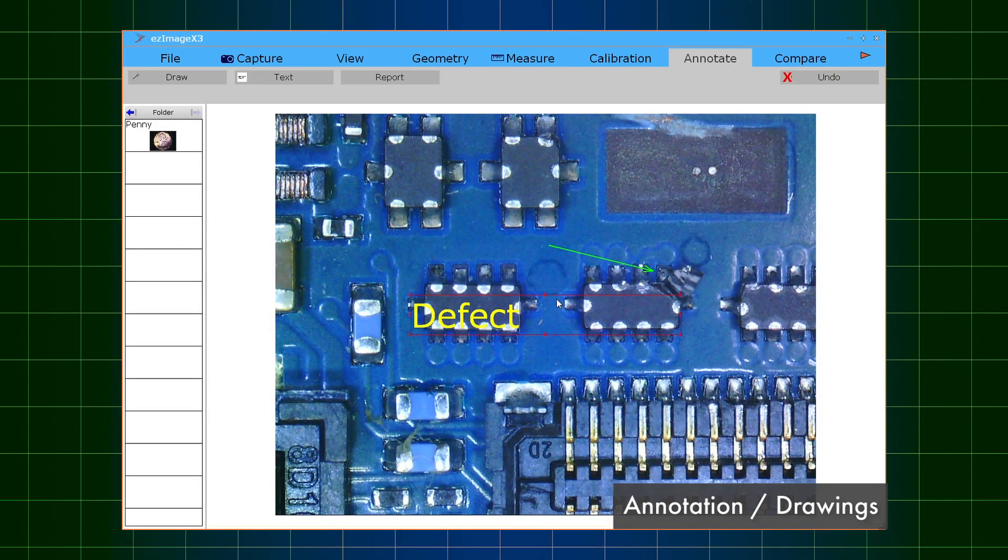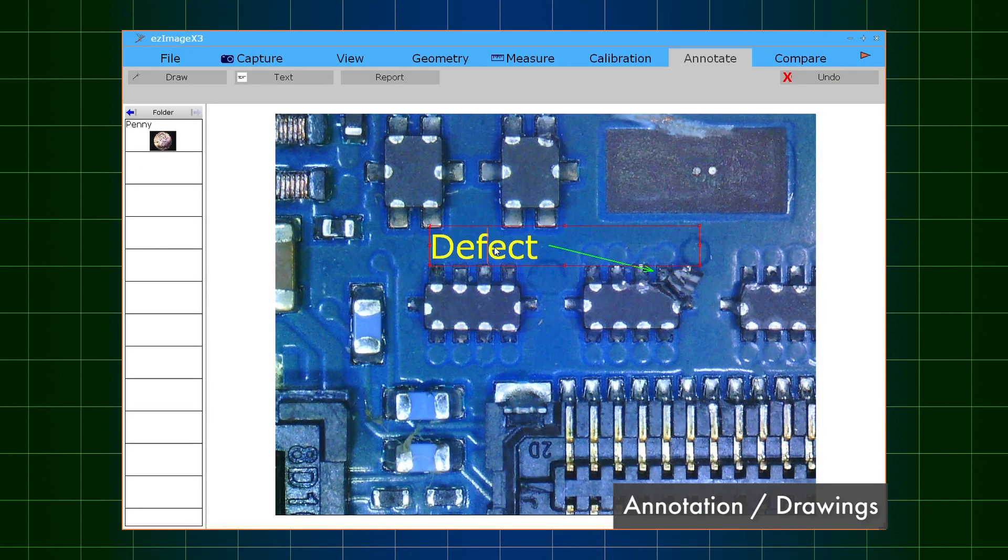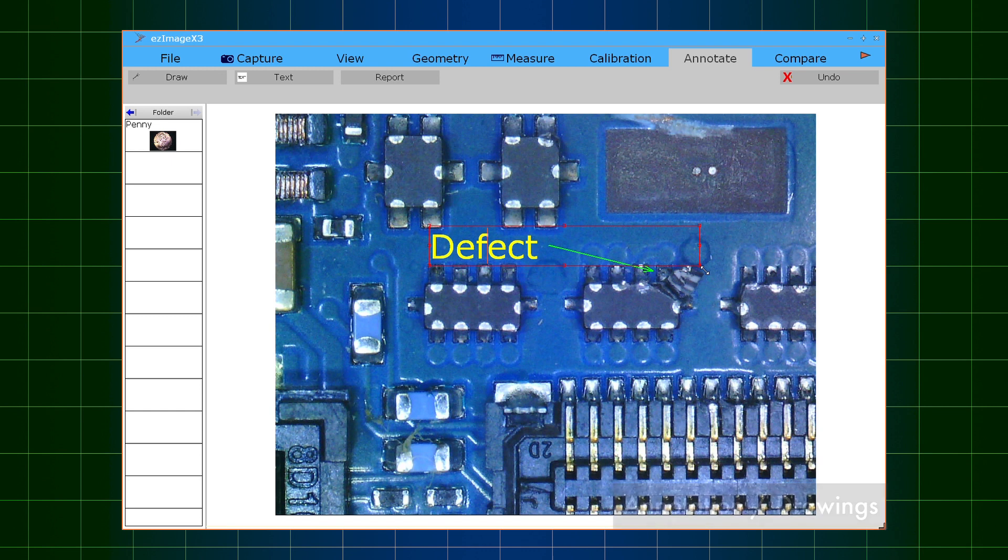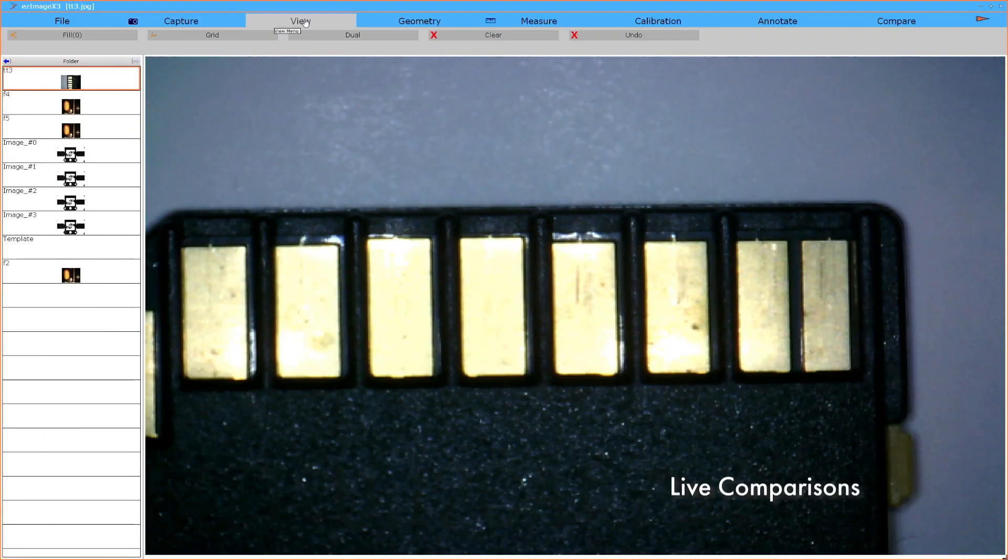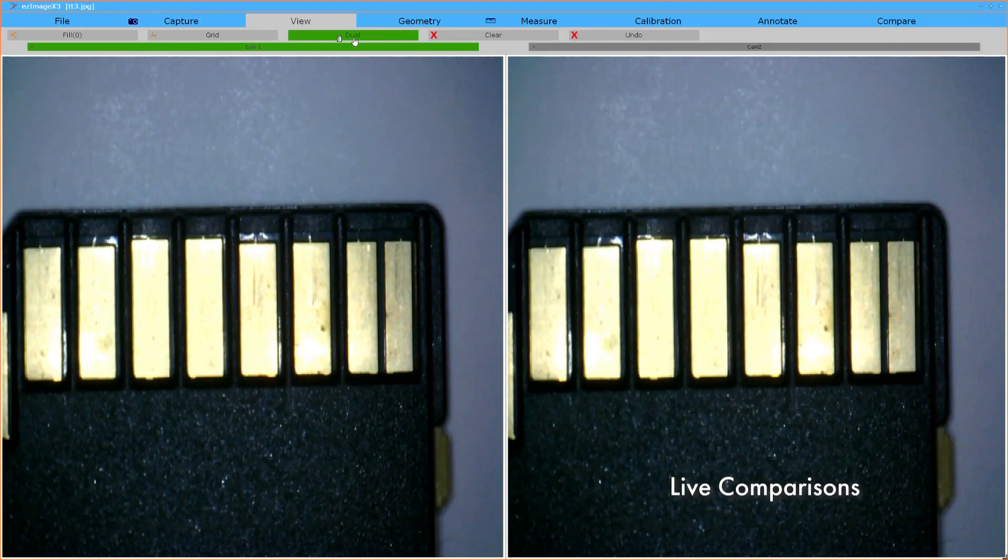Make on-screen notes and arrow drawings to highlight features, defects, or other areas of interest, and compare images side by side.